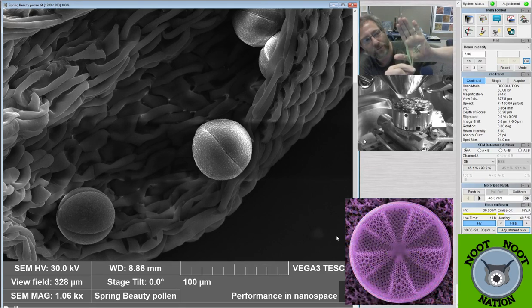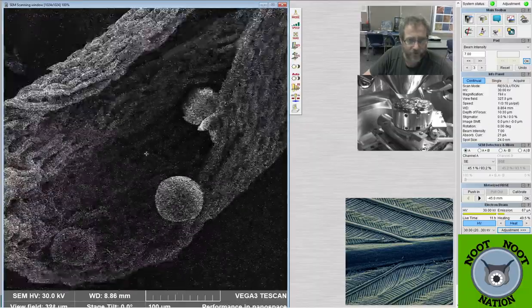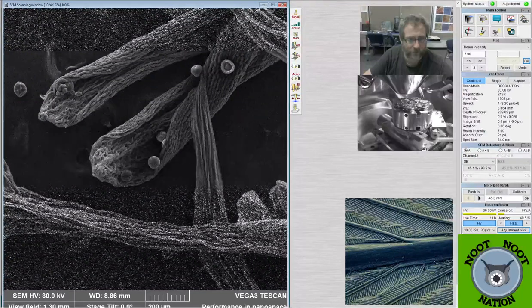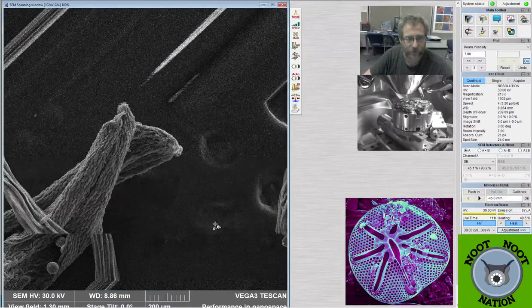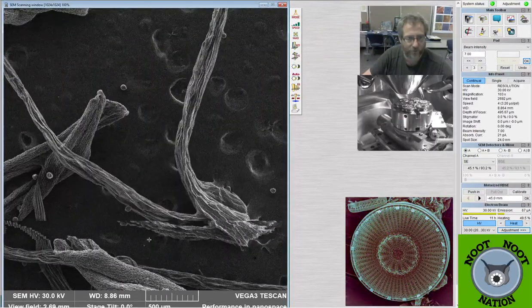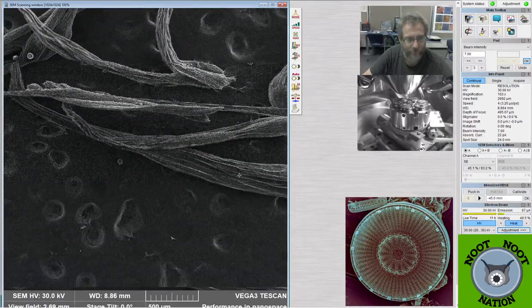And it's common early in the spring. It's one of the first flowers that grow in my yard, and just covers my whole yard. So really pretty little flowers, and they're very common in this area at least. And right now we were looking at one of the, I think that's an anther. And there are some pollen grains laying around, I think, that are gonna be better to image, because they won't charge up as much, but I'm gonna have to go find some of them.